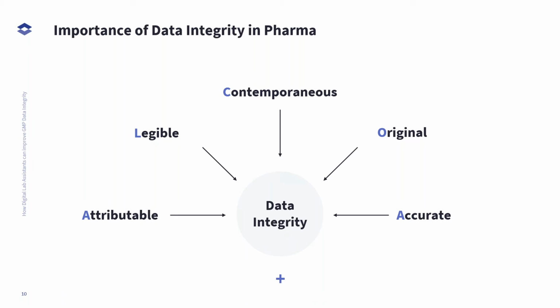But the issue is happening now. They're throwing the piece of paper into the bin. And when the FDA comes into the house, they don't think that this is cool, and they see this as a cardinal sin, because the paper, even the paper towel, was in that very moment the original record.